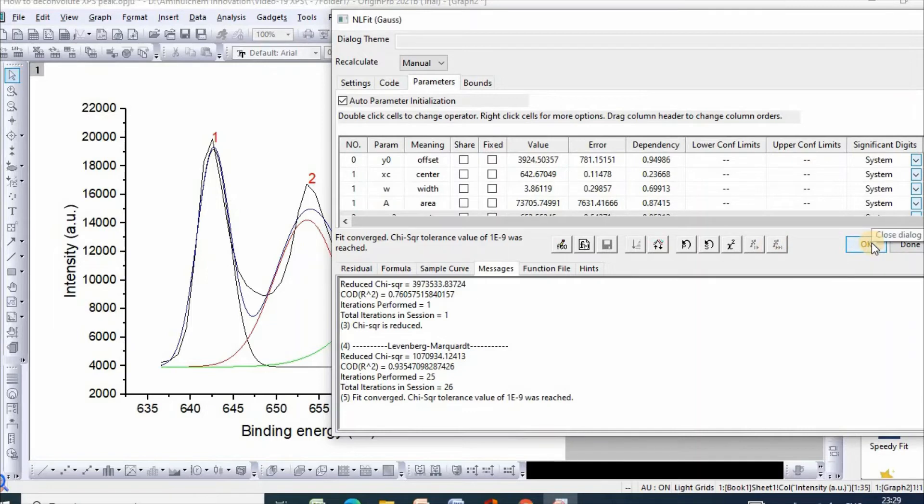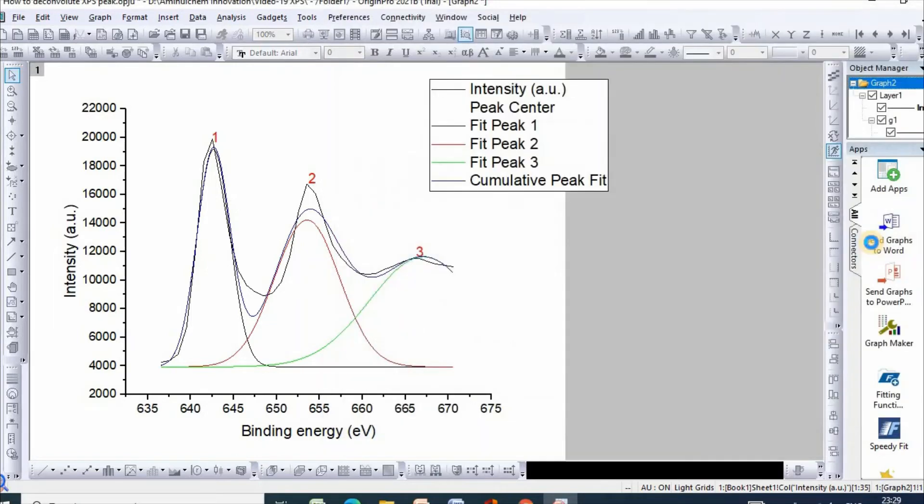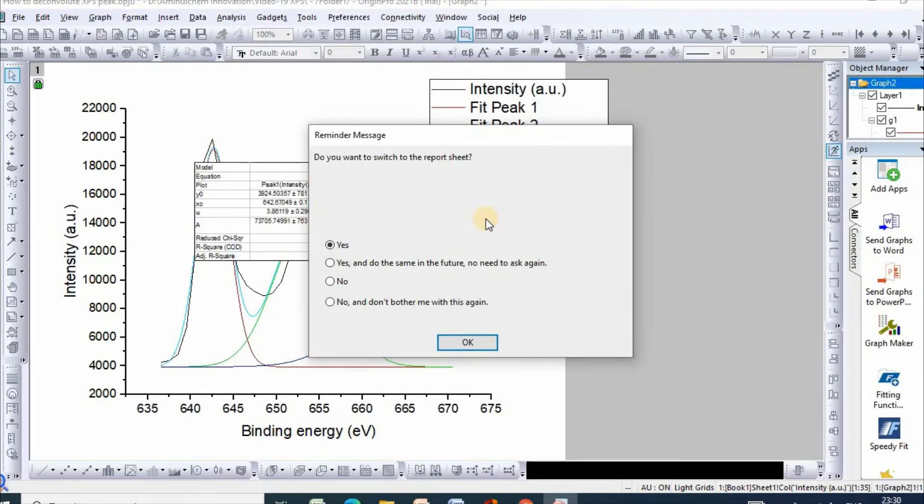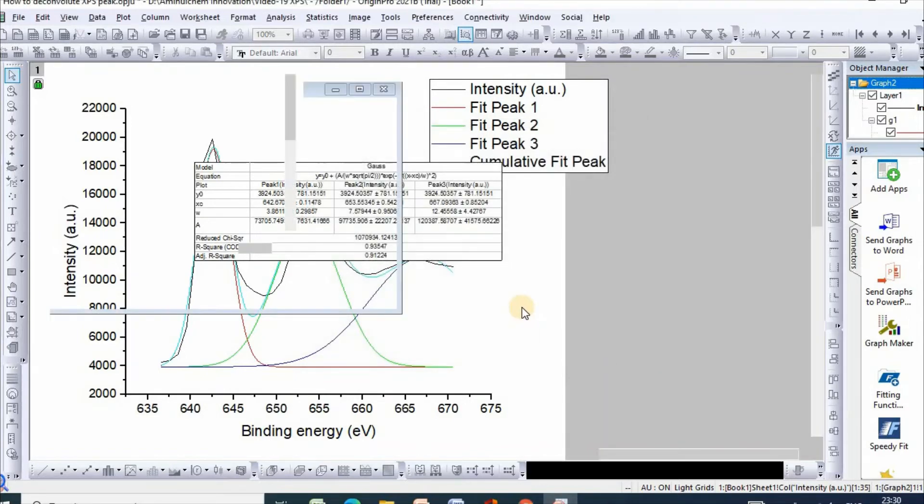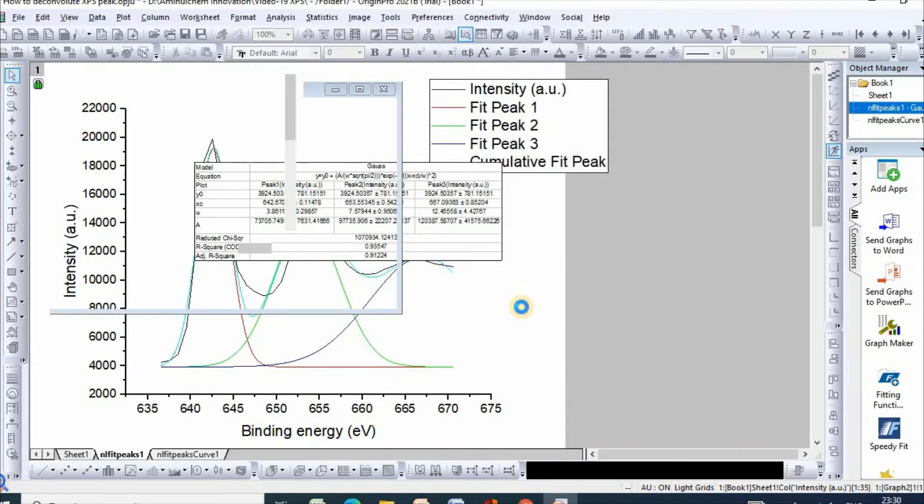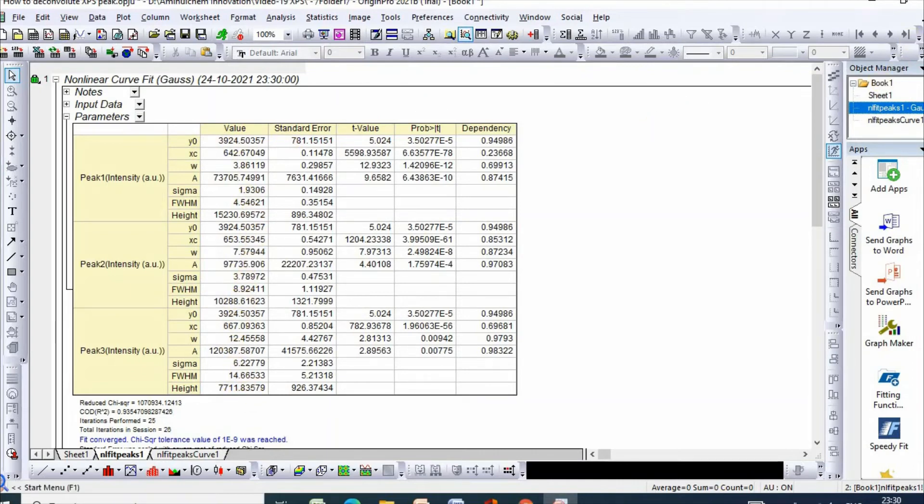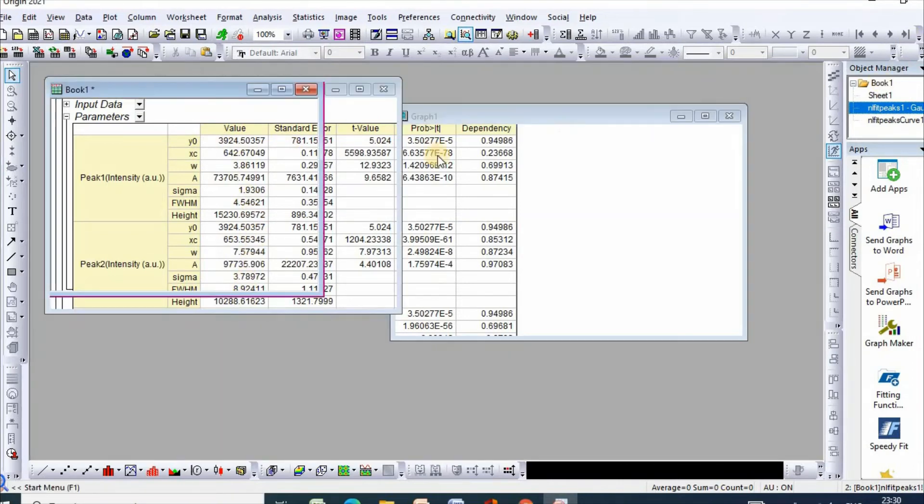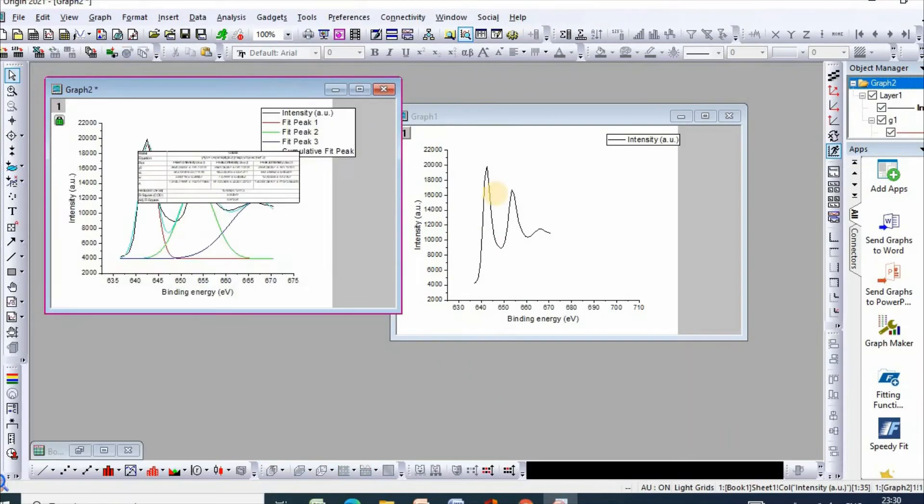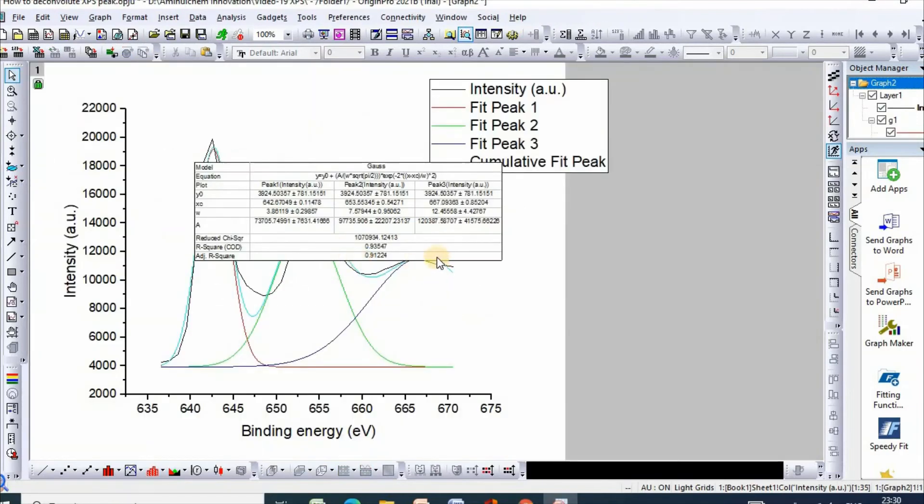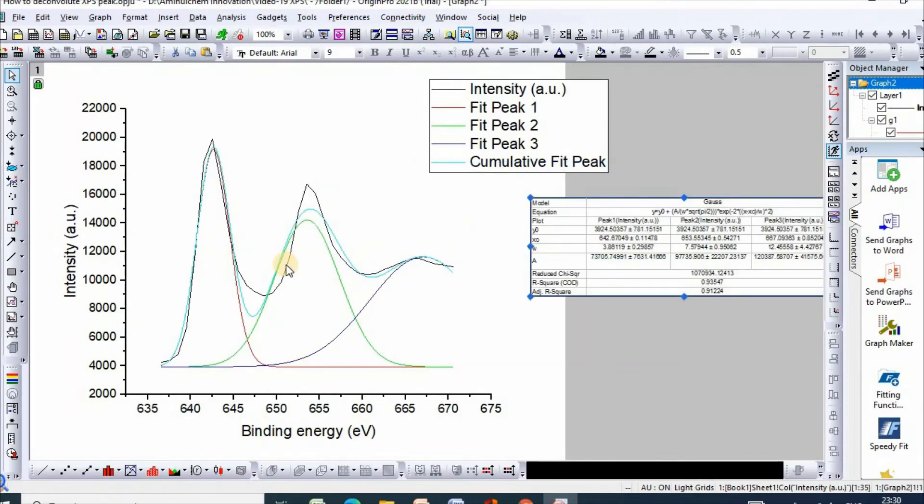Click on the next peak, then click on the next phase. If yes, then click OK. The peak parameters will appear here. So here is your deconvoluted peak.